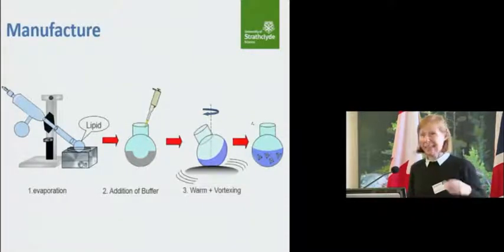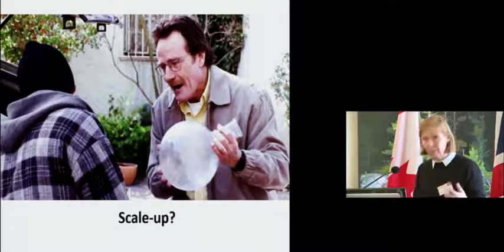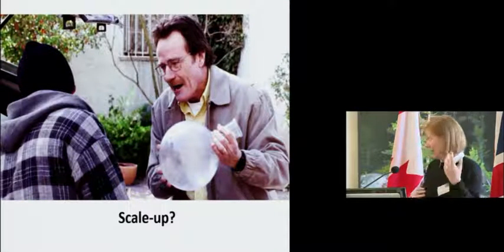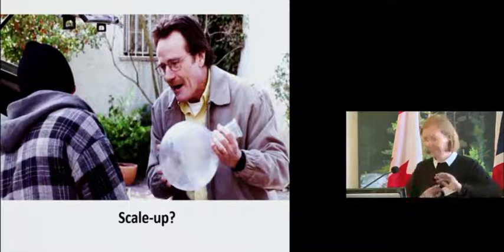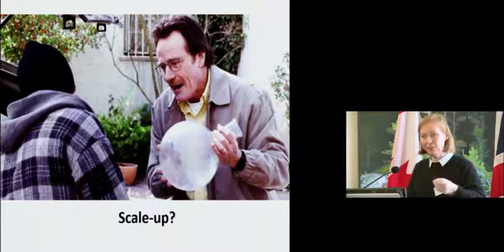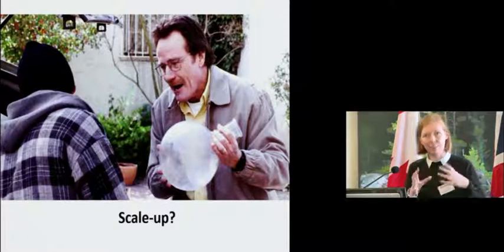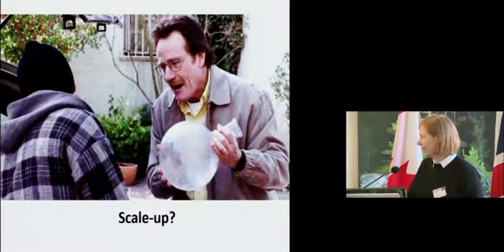But we were making it by that very basic Bangham method, lipid hydration, and we all know there's no way that's going to get anywhere near the clinic doing that. So we really need to think about a scale-up, and for those that watch Netflix, Walter White saying, no way, you cannot use rotary vap, and we all know that. There's no way forward for that. So we had to come up, and that's really how we came across the microfluidic system. We thought, this is great, it's modular, could give us the exact answer to what we need.